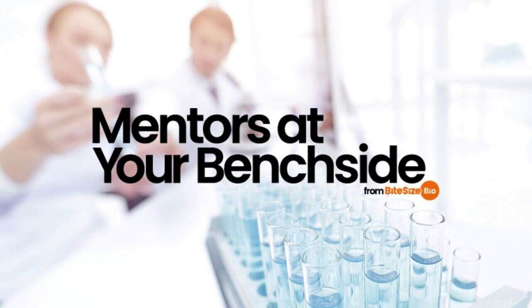Additionally, Western blots can be frustrating and sometimes things don't work out. If you've tried everything and your Ponceau S stains are still looking abnormal, sometimes the best thing to do is to work on something else. You can try with a level head from scratch the next day or even next week. The answer may be right there and you might need to step away from it for a while to get it. In short, Western blots can go sideways at any step in the protocol.